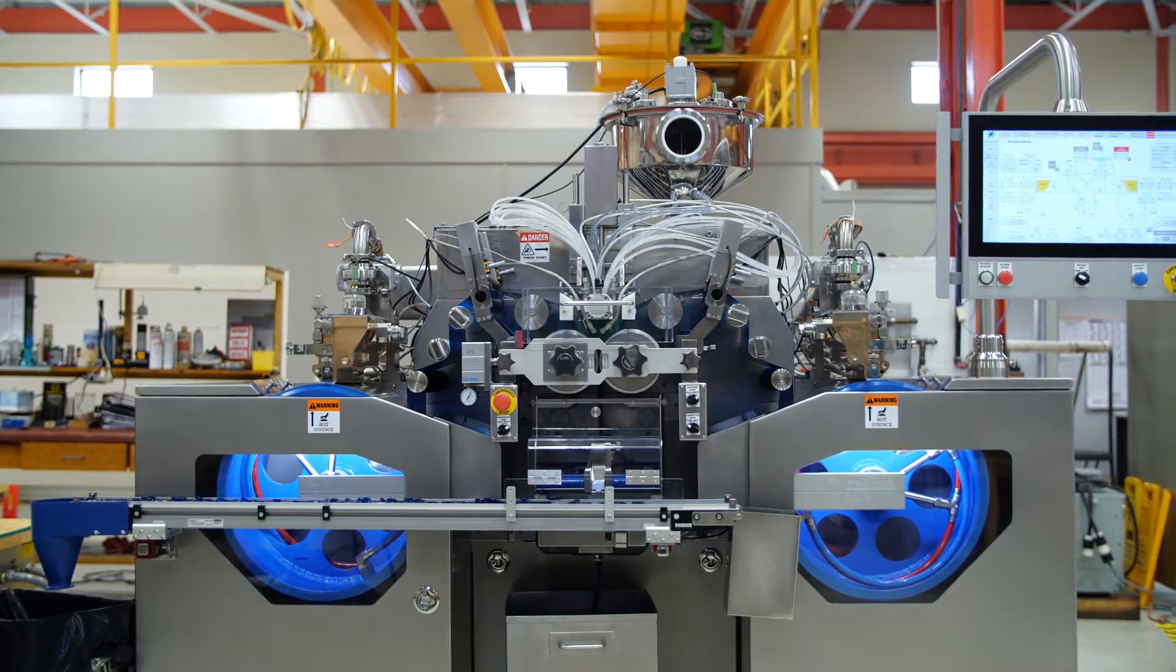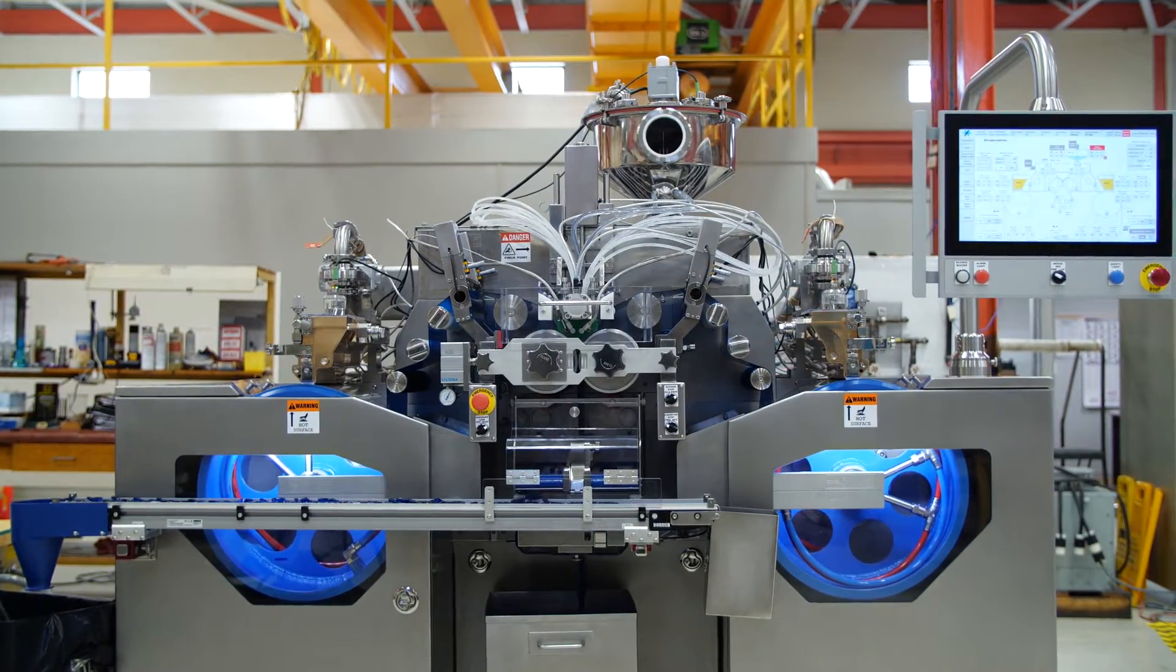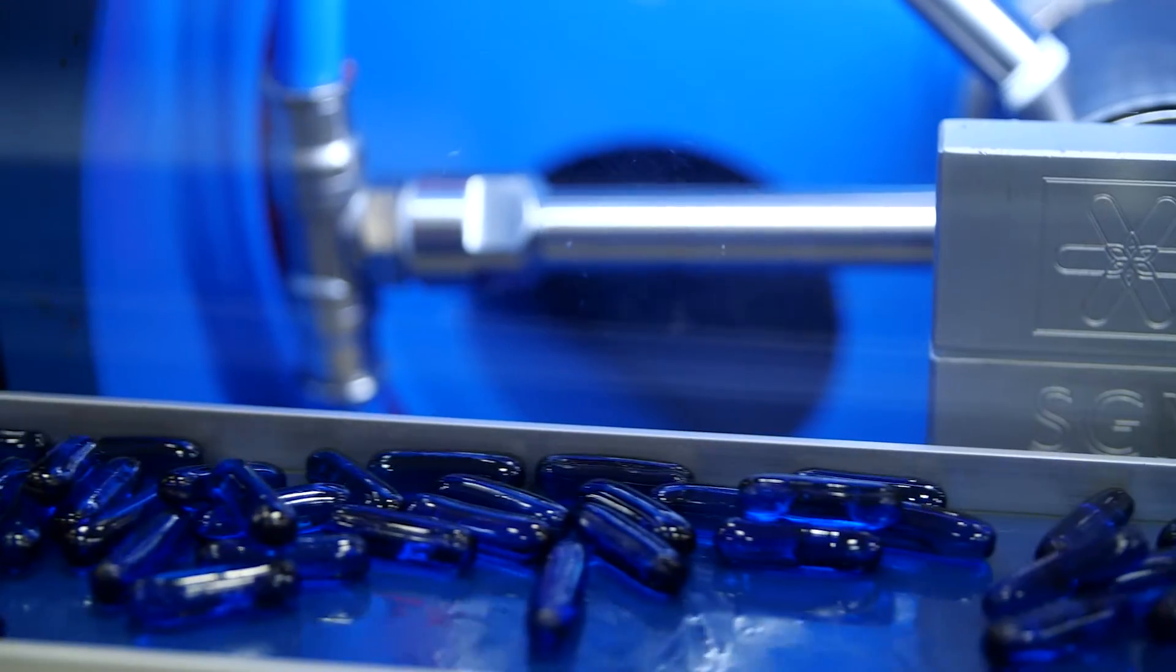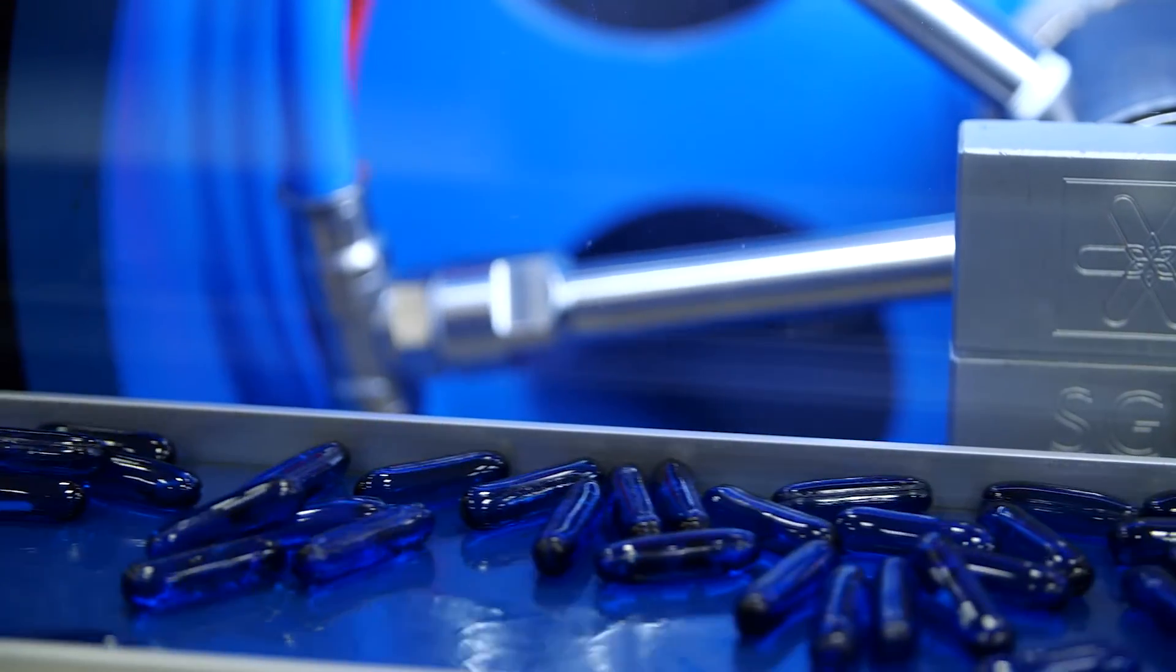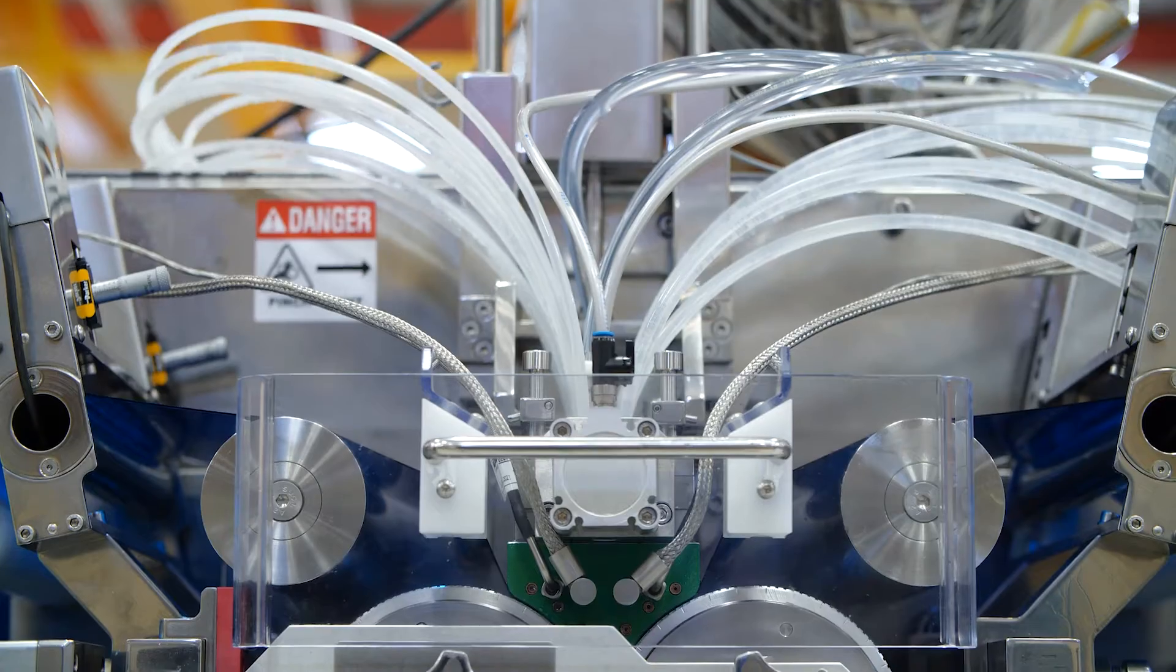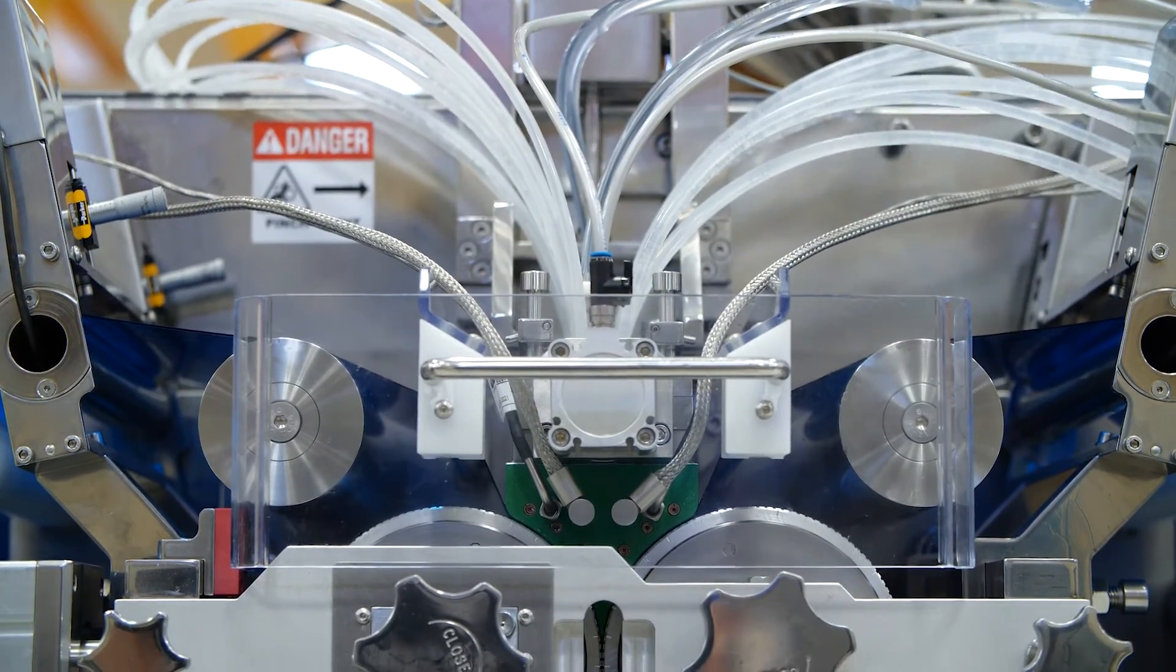TechnoFar's SGM 612 NextGen encapsulation machine offers unprecedented capsule quality, production capacity, and low maintenance due to the flexibility of this latest servo generation machine.